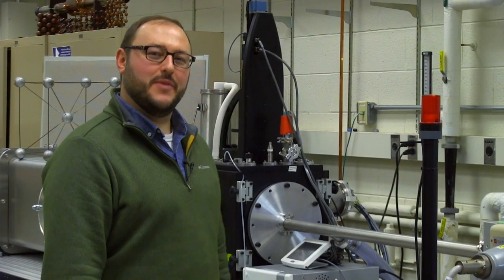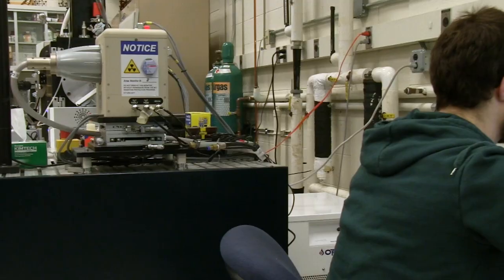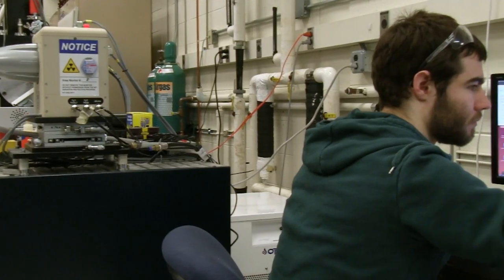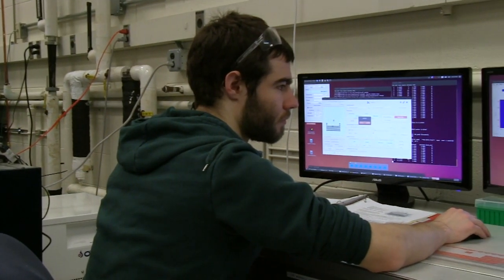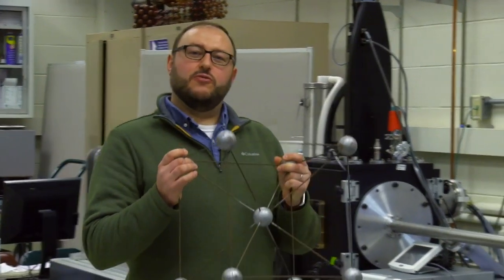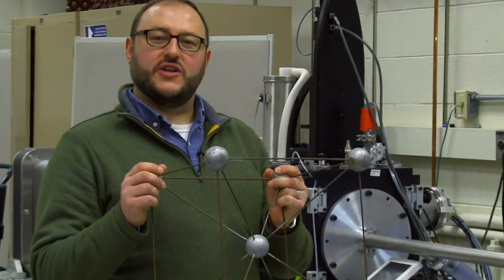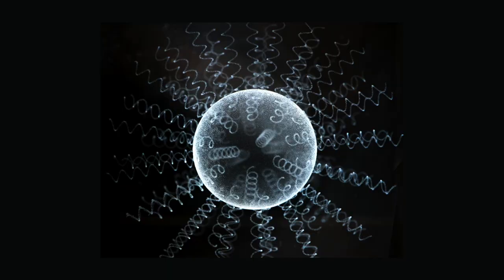Students in Robert McFarland's research group in the Department of Materials Science and Engineering use the small angle scattering system in order to take measurements of samples that are nanoparticles that are arranged in a crystalline lattice. So instead of atoms sitting at the positions of a body centered cubic cell, instead it's nanoparticles that are functionalized with DNA.